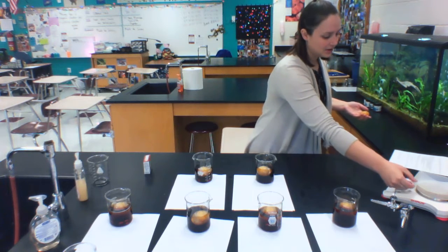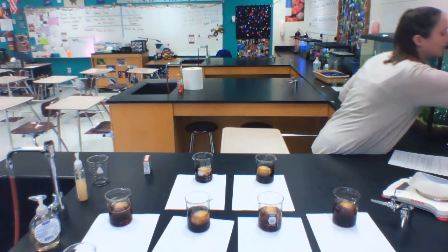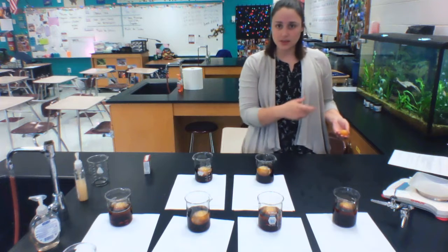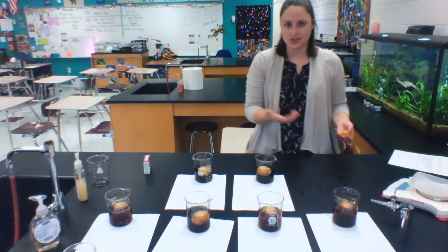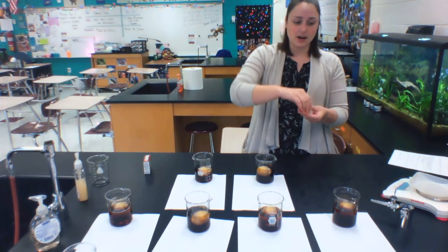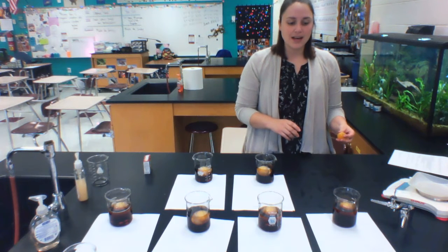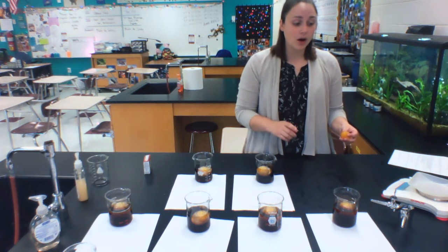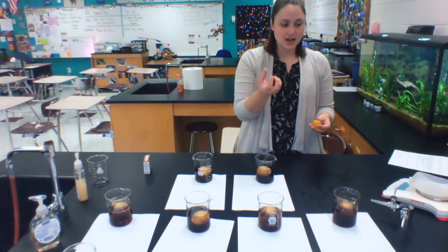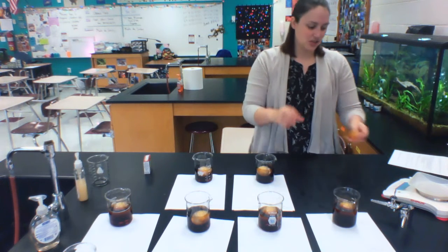Let's find out. So I'm turning on my scale, my balance. And this electronic balance, we'll want to have it at 0 with the weigh dish there because we don't want to count the weigh dish in the mass of the egg. So now that's at 0, and I'm going to put this egg there. Now remember, yesterday when I put the egg in the syrup, it weighed 74.42 grams. And it was like bouncy, but it was not like this squishy. So it's kind of interesting.